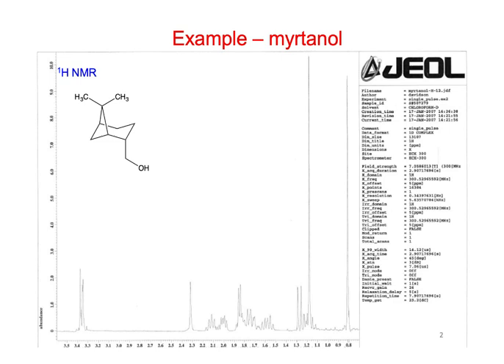The 3.4 is by the alcohol. Right, so these are these two protons here. Notice that, in fact, if you look at this peak, it's a little weird. This one looks more like a singlet. This one's split a little, and there's some stuff down here at the bottom.